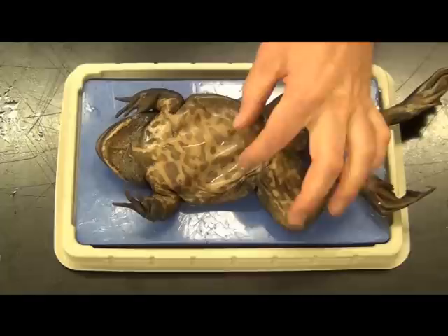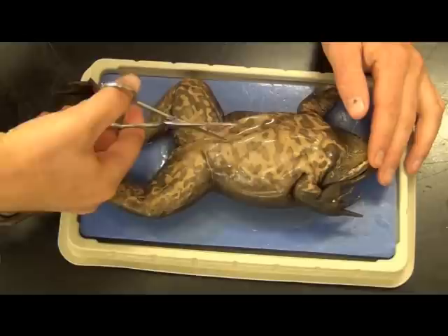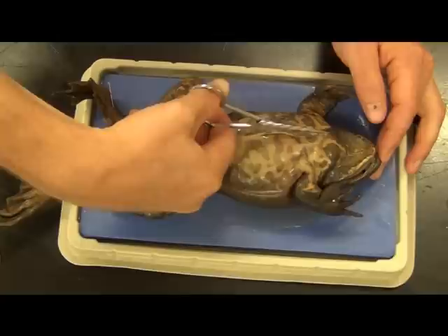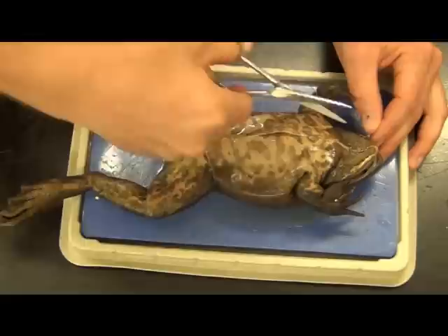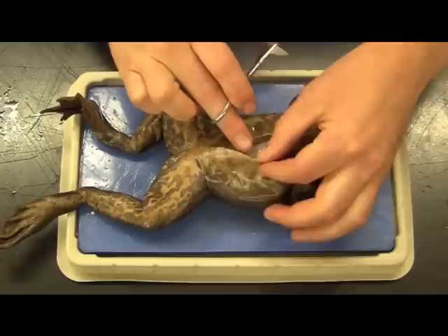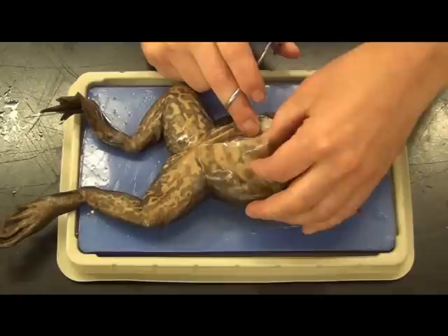A lot of times students will use a scalpel and cut only the skin, missing the muscles. So we're going to go through the skin first, then cut through the muscle layer into the internal cavity. Being this size, I can flip this guy around. Some specimens will allow this, some will not. If you're having to exert a lot of force, go ahead and get guidance from your instructor — do not force anything with these sharp tools. You'll notice that the skin peels back, and underneath you can still see the muscle intact — the abs and chest of the frog — so I haven't actually cut into the body cavity yet.